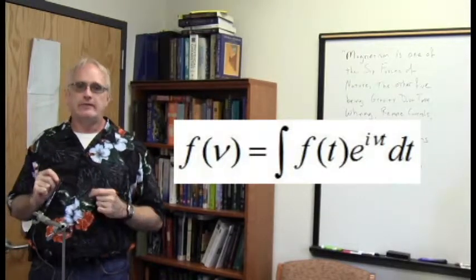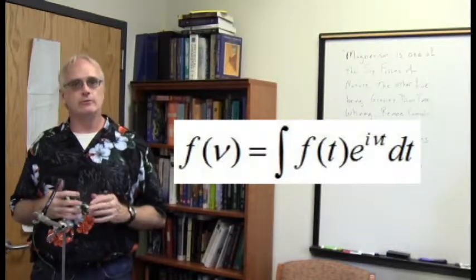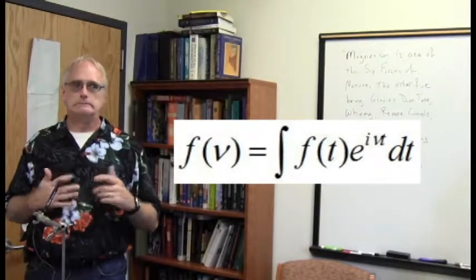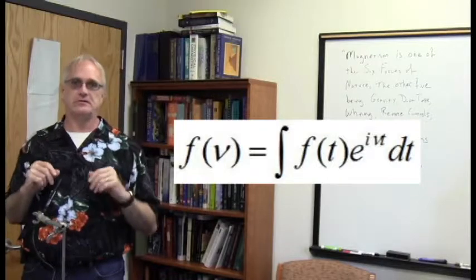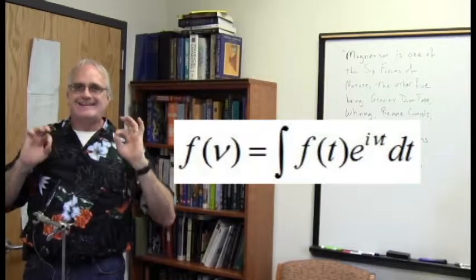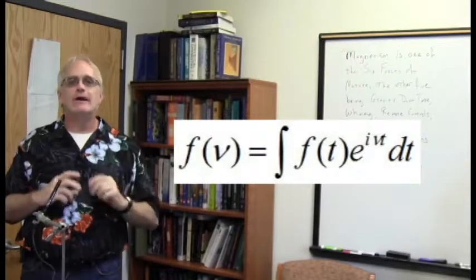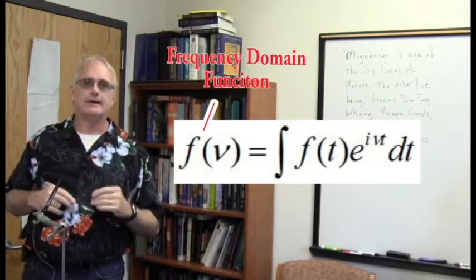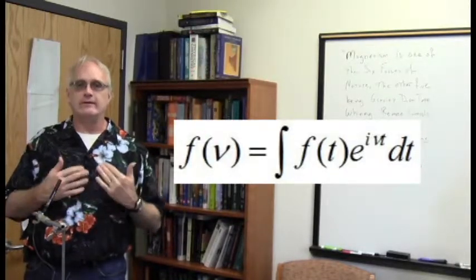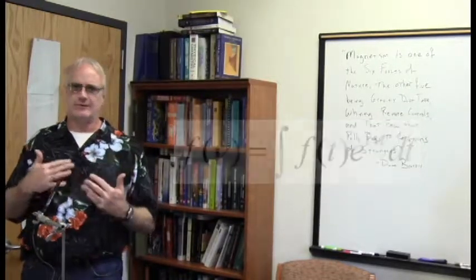It basically takes a function that is oscillating over time, like, for example, a sound wave that has been recorded from my voice or from a tuning fork or a bunch of radio stations all playing at the same time. And it takes that what's called time domain oscillating function and comes back with a frequency domain function, it's called. Basically a function that marks what frequencies went into building that sound wave. Now that's easy enough to say, but it's still a little bit of a fuzzy concept.